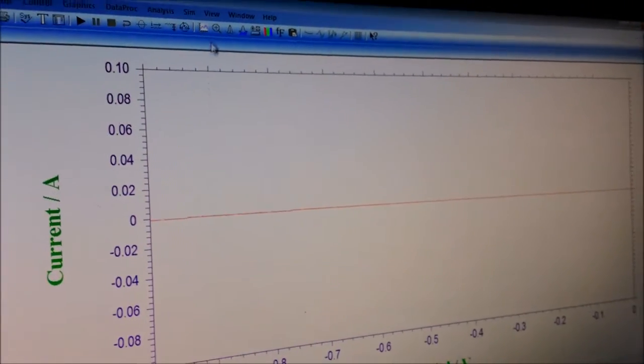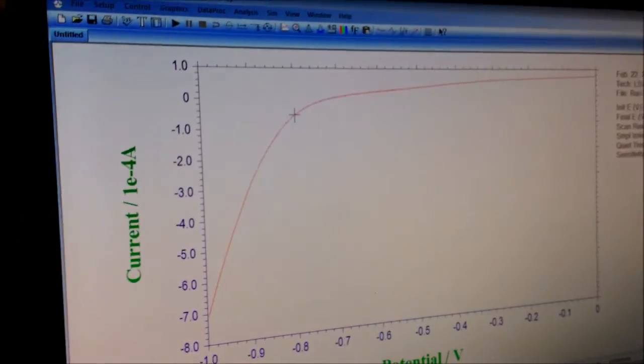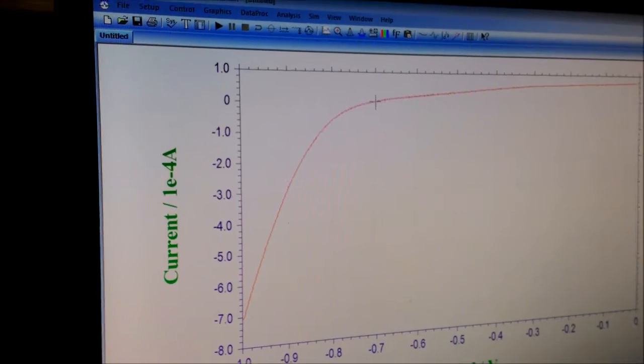It is finished. Now looking at the data plot, here you can find the knee. So I can choose minus 0.7 volts as the voltage for the electro-deposition.